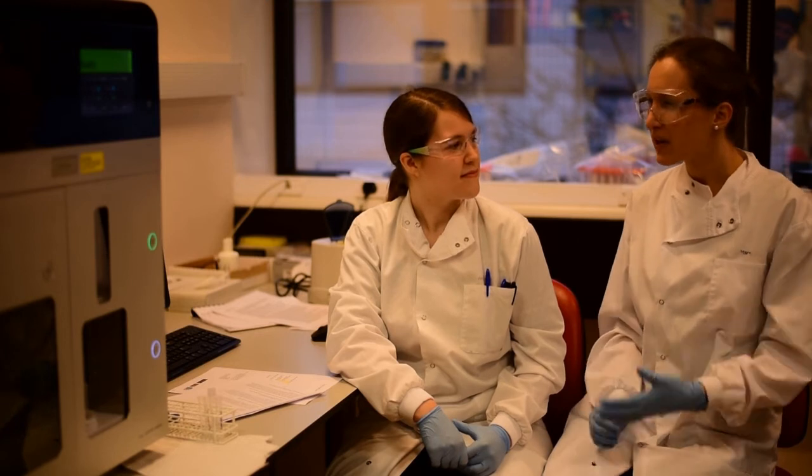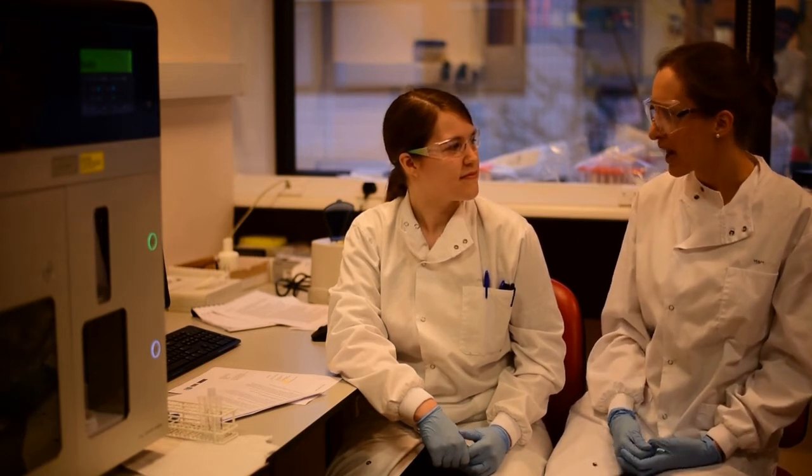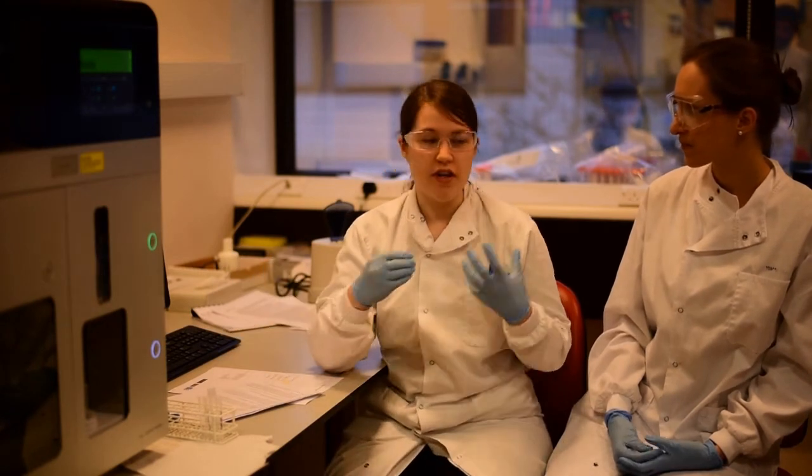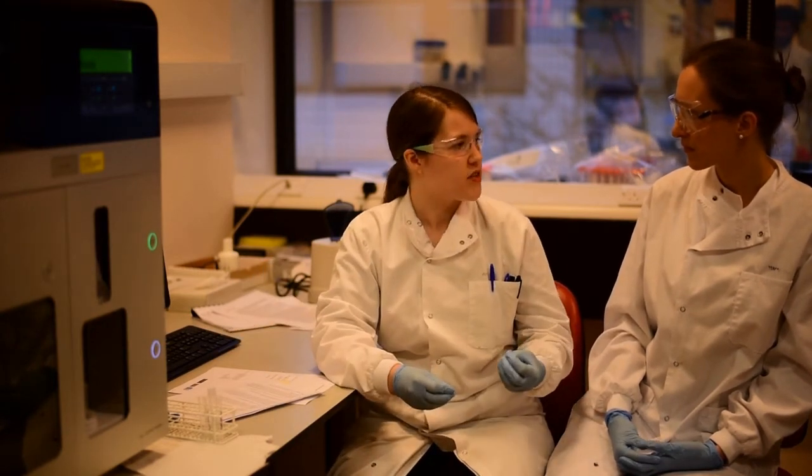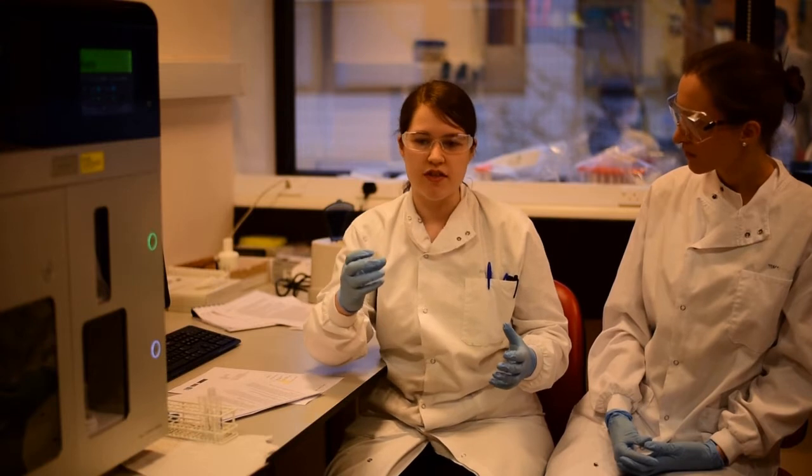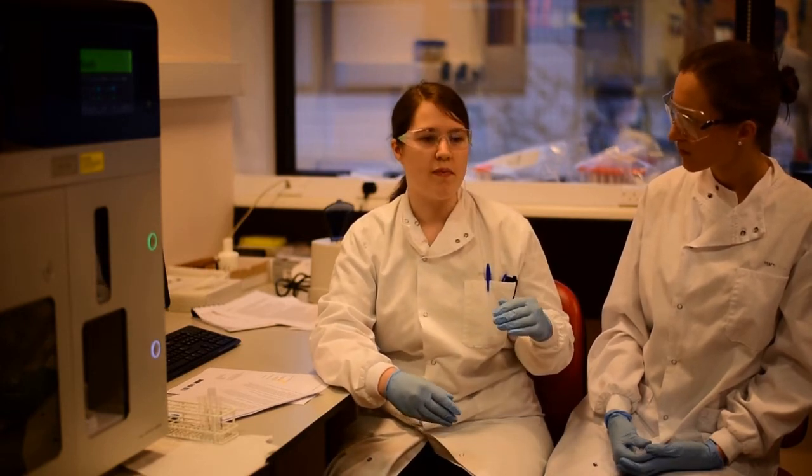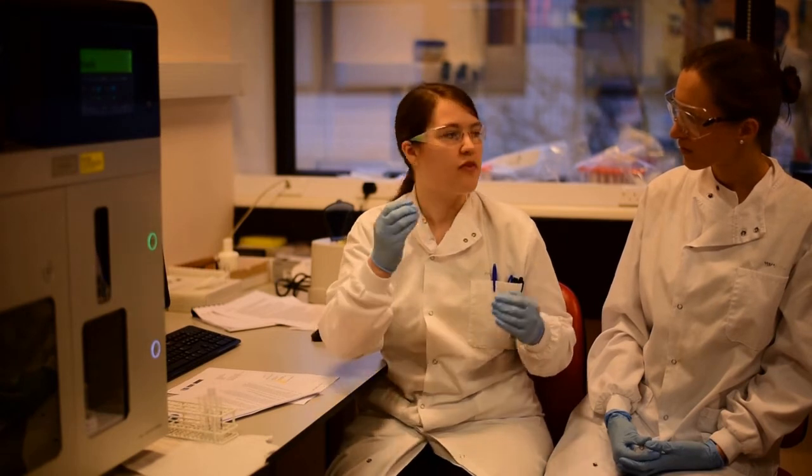This is Abigail, she's a flow cytometry expert and she's going to tell us how that works. So Abby, this is a really cool machine but what does it do and how does it use antibodies? So this is a flow cytometer and we use it to pick out specific cells from a mixture of different cells. Like in microscopy, we use antibodies connected to fluorophores to detect specific proteins and identify specific cells. Unlike in microscopy where you look down on the cells from the bottom through the lenses, we pick out cells as they run through the stream.